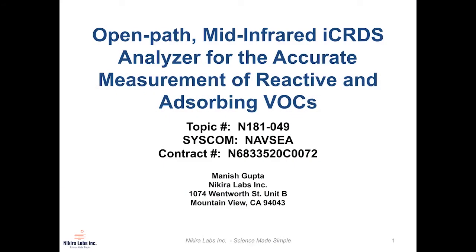My name is Manish Gupta. I'm the Chief Technology Officer at Nikira Labs. We were fortunate enough to receive a DoD Phase 2 program to develop next-generation air monitoring for naval submarines with a special focus on volatile compounds.